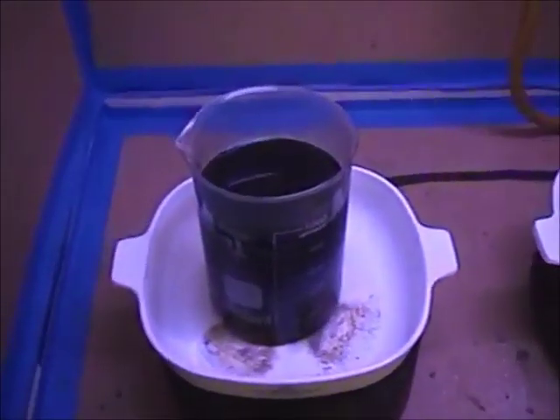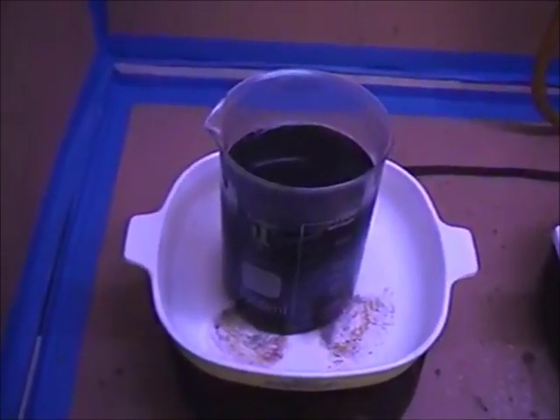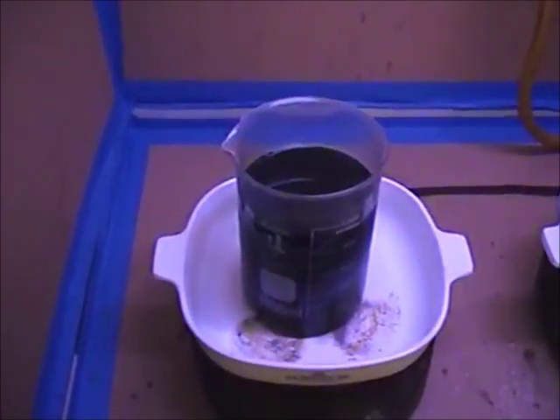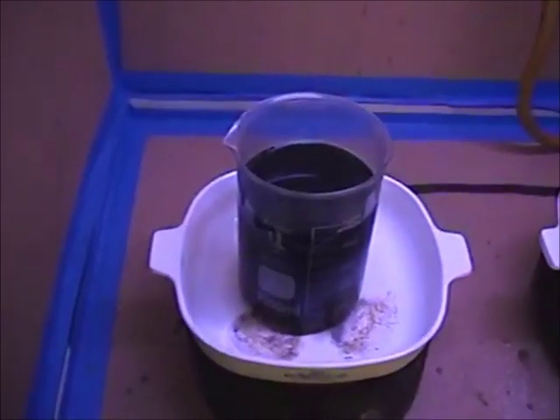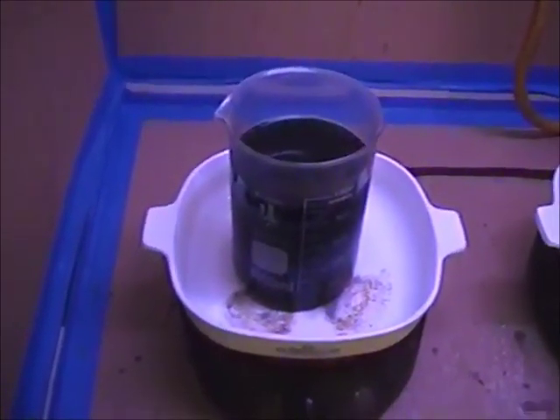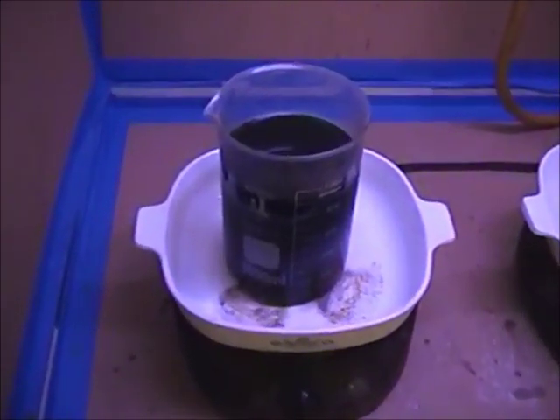Now, back over here for a moment, and something I need to touch on. When I dissolve this, there's an excess of nitric acid in there. Normally, if we were using the cementation process and trying to put copper in there to separate our silver from the solution, what would happen with that excess nitric a lot of times is it starts consuming copper. It has to consume copper to use the excess nitric before any silver starts precipitating from this solution. So you have to get rid of the excess oxidizer. And a lot of times when you have excess oxidizer and you try to use the cementation process, what winds up happening is you wind up with a lot of copper oxide in your product, and it's a trashier product. Now, of course, that's separated with the silver cell, but there again, you don't want to introduce more copper into the silver cell than you have to, because it depletes your electrolyte solution.